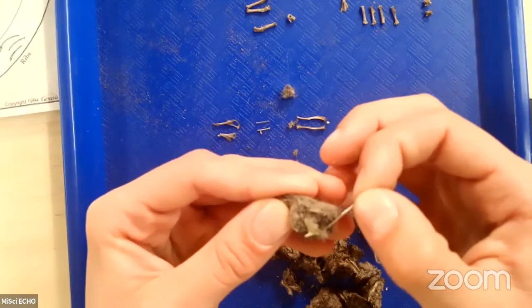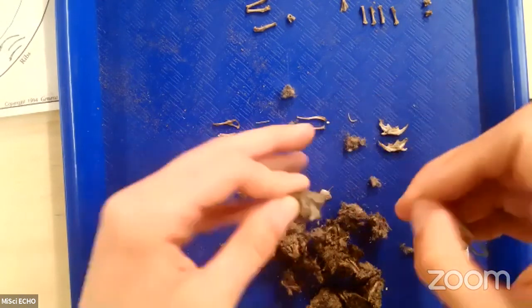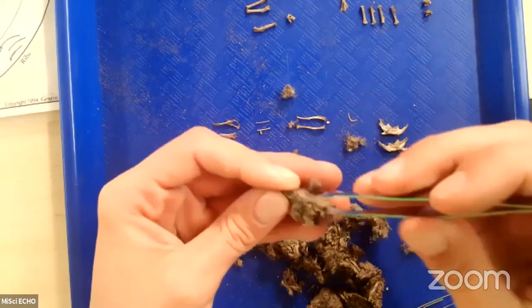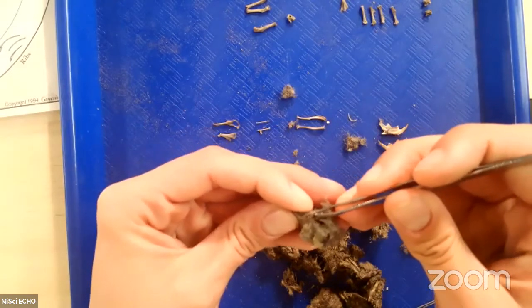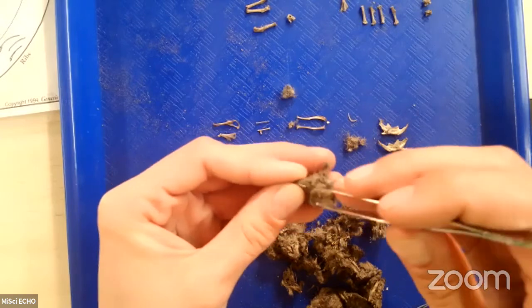But of course, we'll get more rodents and shrews, right? So if you ever do get a chance to do this dissection, if you do happen to break something, one of the bones that you're pulling out of your rodent, that's okay. We want to try not to, that way we can get the best look at everything inside.